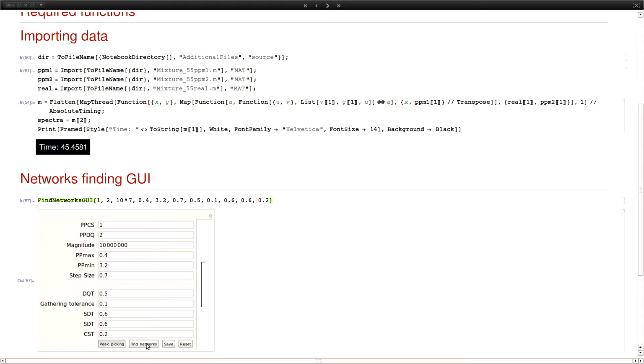So from the spectrum you can determine how this carbon is organized. What's the chain? Yeah, and eventually, from here, we can also find out the topology of the whole molecule. And that will be a nice update for that.